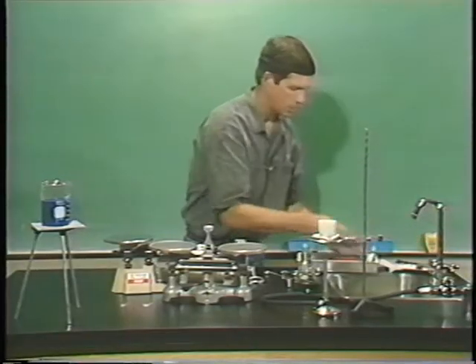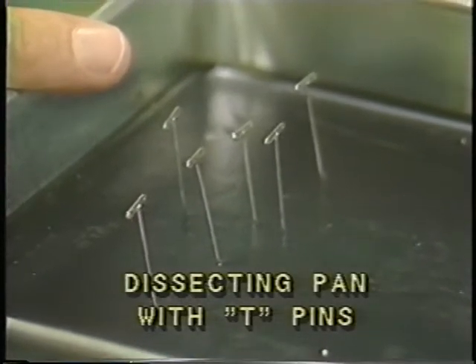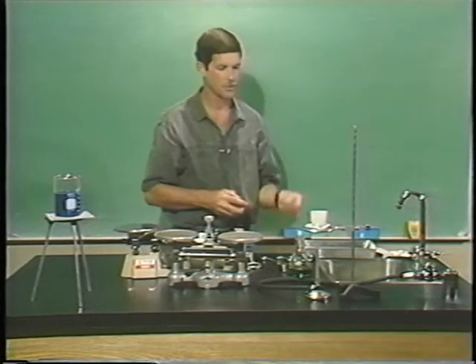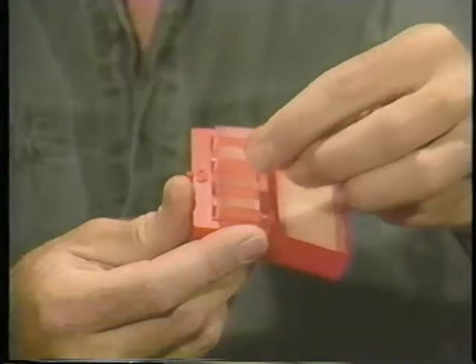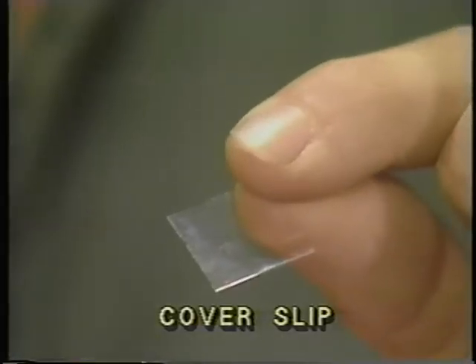Inside the dissecting pan, you'll see special pins. These are T-pins for holding down specimens. Then, when you're working with your microscope, you have to know what a microscope slide is. And along with the microscope slide, we have little tiny square pieces of glass or plastic that we put over it. These are called cover slips.